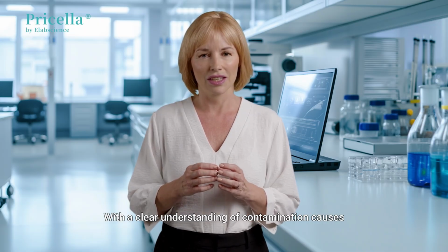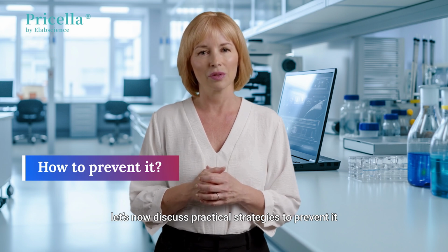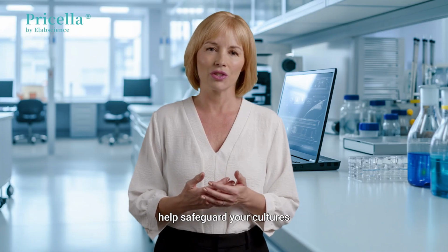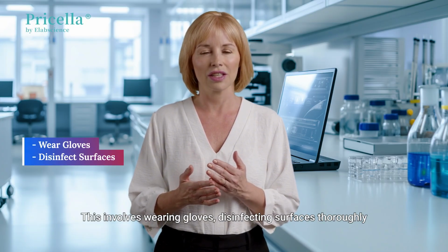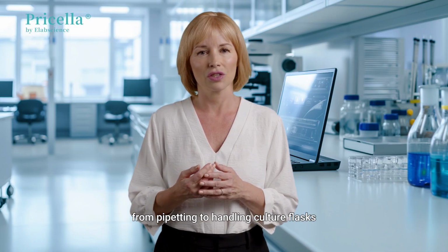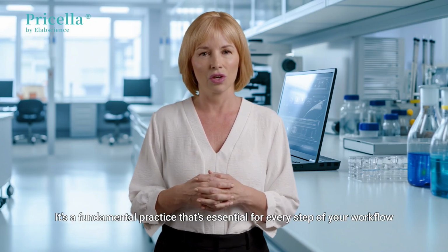With a clear understanding of contamination causes, let's now discuss practical strategies to prevent it. Implementing these simple yet effective measures will help safeguard your cultures and ensure reliable results. First and foremost, always practice proper aseptic technique. This involves wearing gloves, disinfecting surfaces thoroughly, and using sterile equipment for every task, from pipetting to handling culture flasks. It's a fundamental practice that's essential for every step of your workflow.